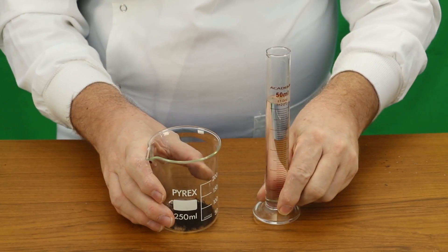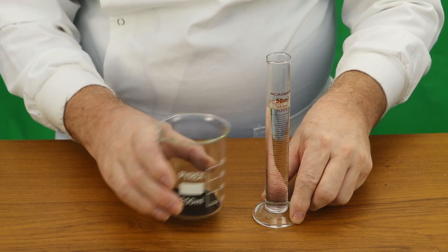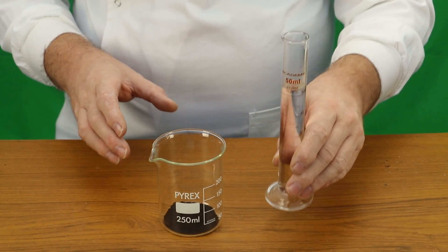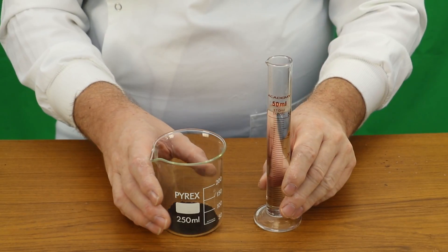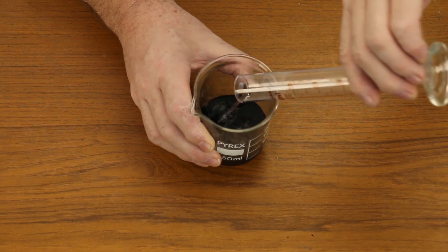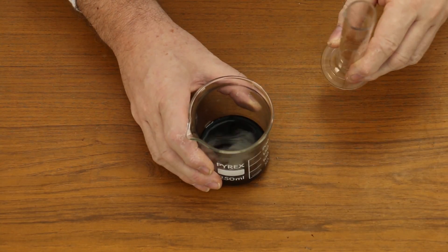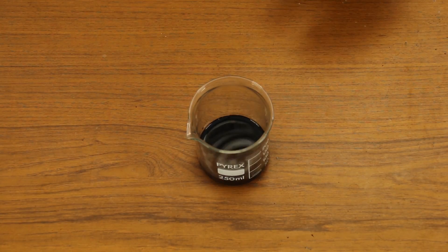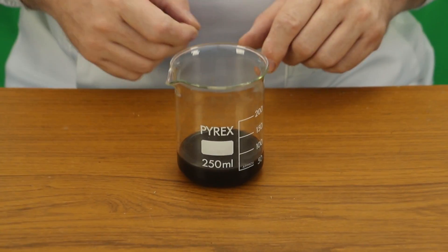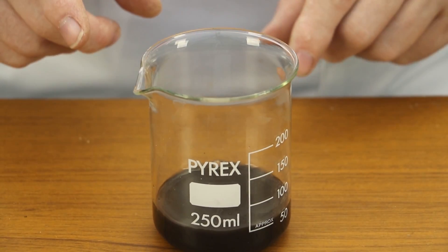So here is our reaction mixture. We have 8g of copper oxide and 50ml of 2 molar sulphuric acid and we are going to combine these two. With this reaction nothing visible happens, and in fact to get this reaction to work we need to heat the mixture.